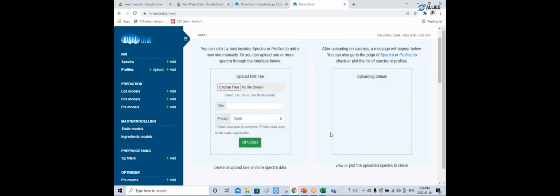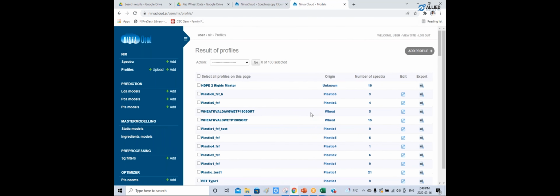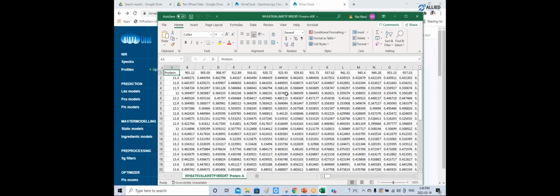Once you click on the analysis, then you'll see all the different features that appear in here. So you can put your spectra there. These are all different spectra. But normally the way we do it is that we upload profiles. And this is what the first page also showed us. So upload profile. What do I mean by that? What I mean is that you make a profile, just like in that Heather Brooks page that I was showing, how she set up the spreadsheet.